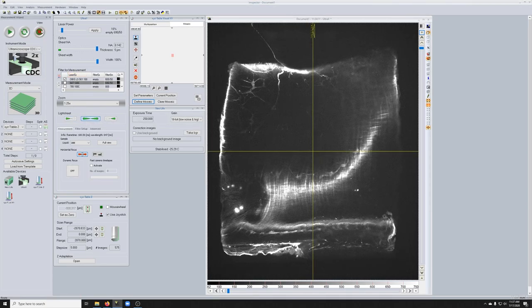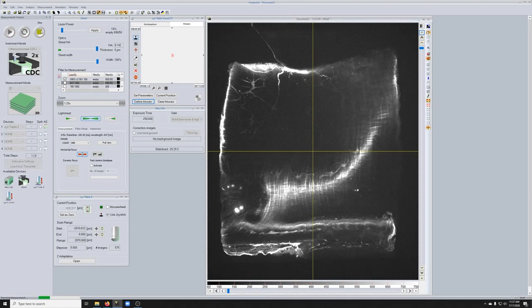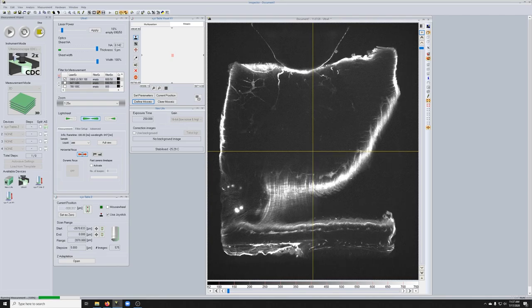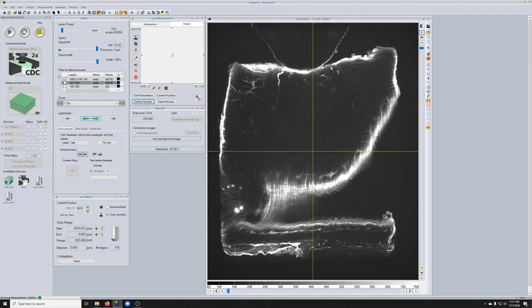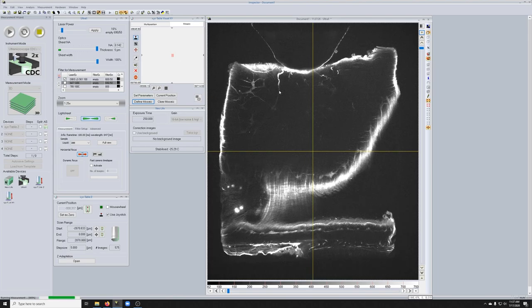If I click here, it takes an image with the right light sheet, then with the left, and then merges them together. This obviously takes longer, but it can be a good option if you want nice and even illumination throughout.